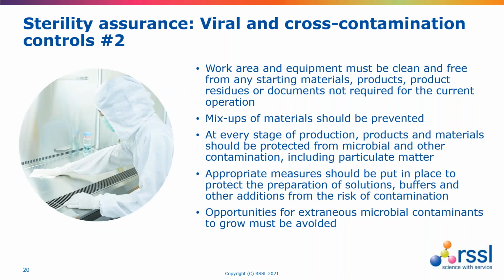Further important measures include before any manufacturing operation starts, steps should be taken to ensure that the work area and equipment are clean and disinfected and free from any starting materials, product residues, or anything else. That might be documents or unwanted materials not required for the current operation. It's especially important that mix-up of materials is prevented, and special precautions should be taken to avoid mixing human-derived cell materials or other dedicated materials.